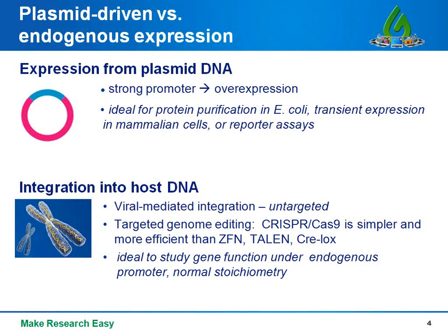So targeted genome editing is definitely the preferred approach if you want to study gene function under the control of endogenous promoters, or if your assay requires that you don't disturb signaling cascades by introducing an overexpressed variant that's going to outcompete endogenous proteins for binding partners. In these cases, instead of overexpression from a plasmid, you should consider a targeted knock-in strategy. We'll return to this idea in our case studies, but for now, let's dive into examining the plasmids we're going to use for expression constructs.